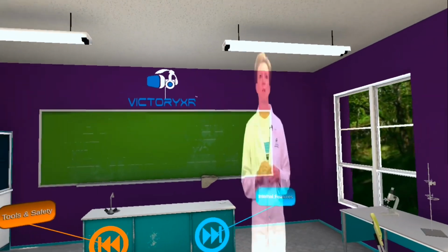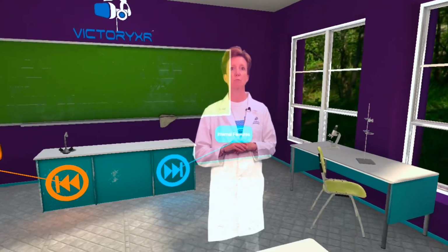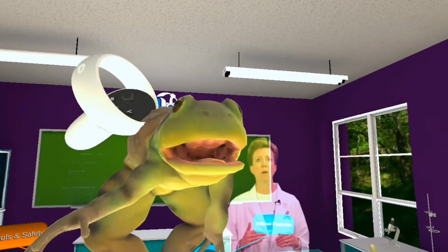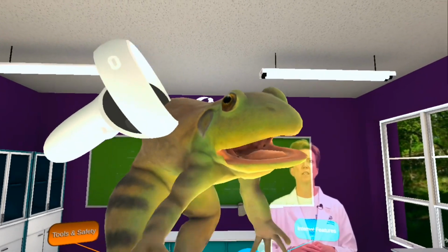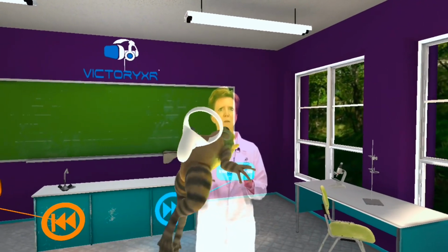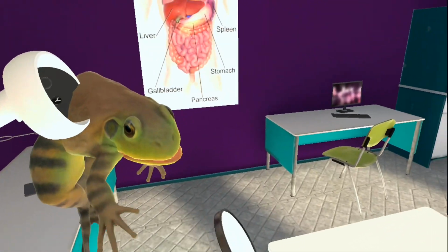Now we're going to look at the eye. Frogs have large, bulging eyes that rotate in their socket, providing sight in almost any direction. Frogs have upper and lower eye membranes, and in addition, they have a nictitating membrane. This thin membrane comes from the lower eyelid and can cover the eye to clean and protect it. It's not always visible in a preserved specimen, but if you use the magnifying lens, you may be able to see it on the lower eyelid.